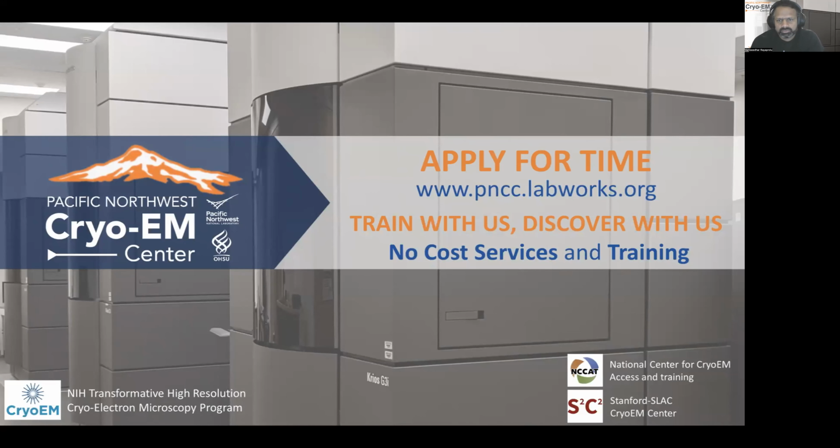A quick intro into what we offer here at PNCC for researchers. We have two types of proposals. The first one is a screening access proposal, which allows you to come on site for up to 5 days of sample preparation and screening with staff. So you'll be on site just doing all the things and learning all the necessary information about grid freezing and screening and data collection. This proposal is aimed at low resource institutions.